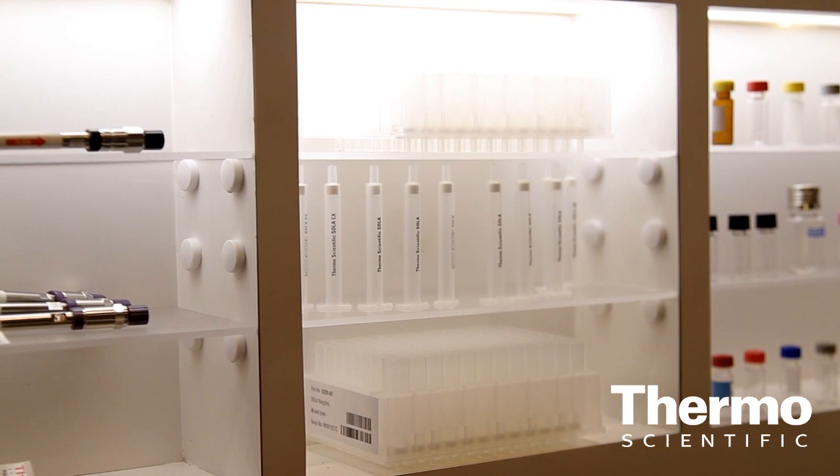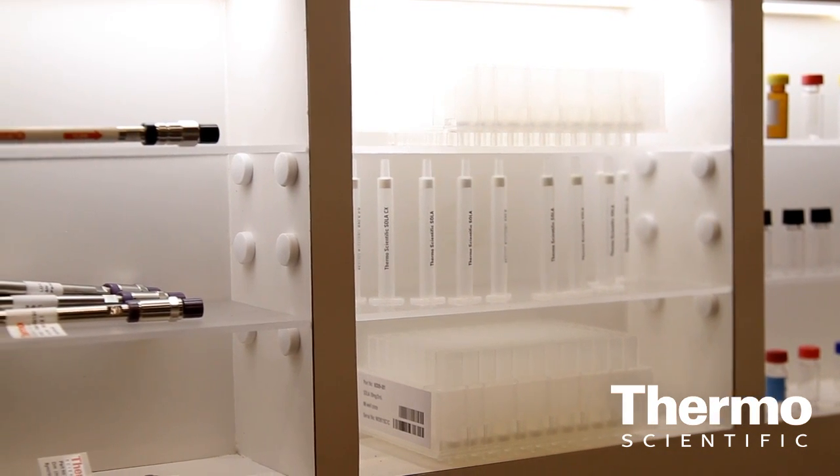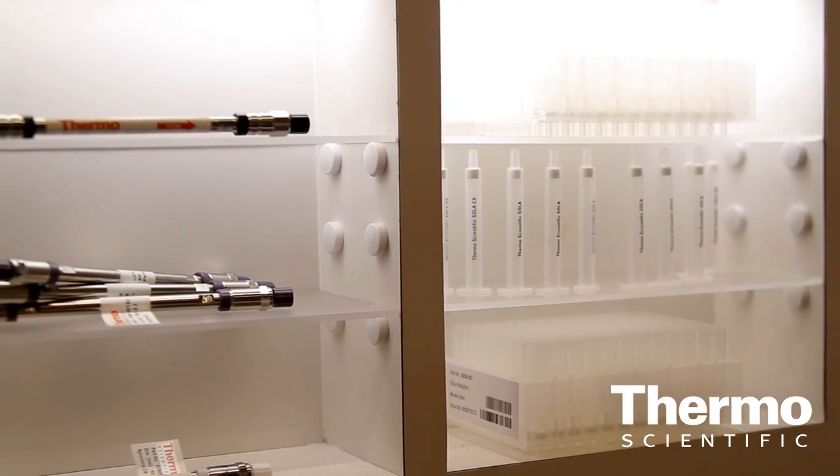Now with SOLA, we're able to provide that removed rework in a reduced volume that enhances sensitivity for the user. And what's the feedback so far from customers? The feedback has been tremendous — they love it. They think the reduced variability column to column is a real positive aspect of this technology. It helps them to get sharper samples and more sensitive assay results, and it means they don't have to rework samples. That is the key plus.